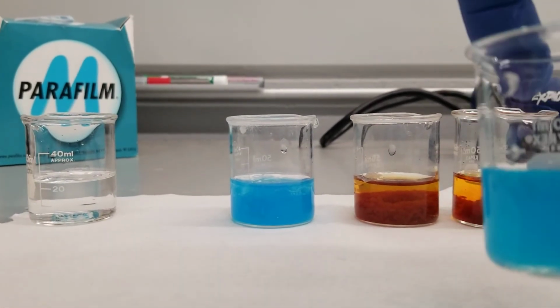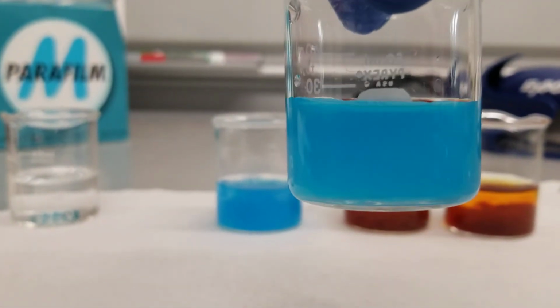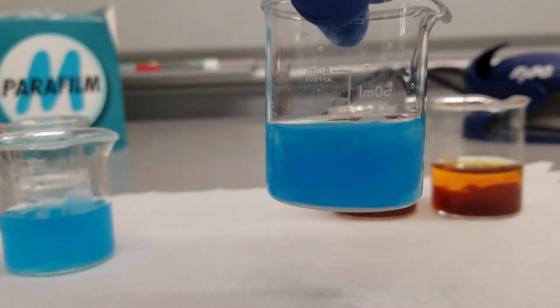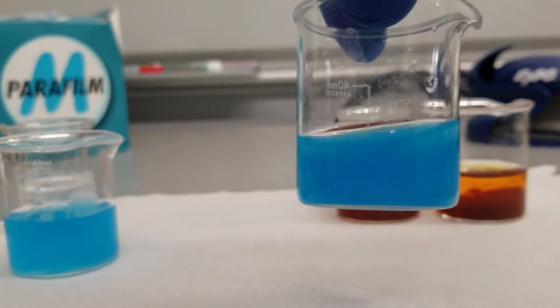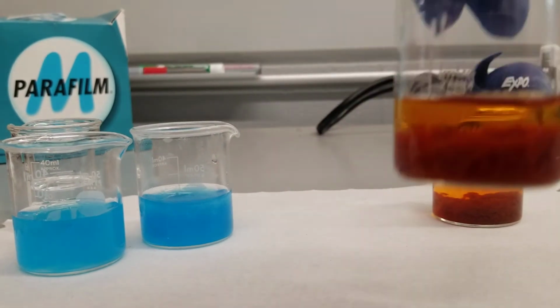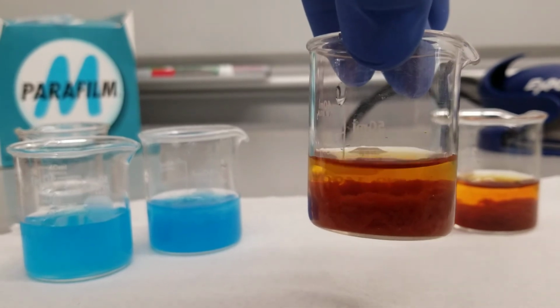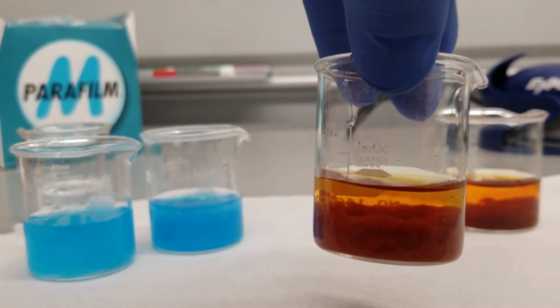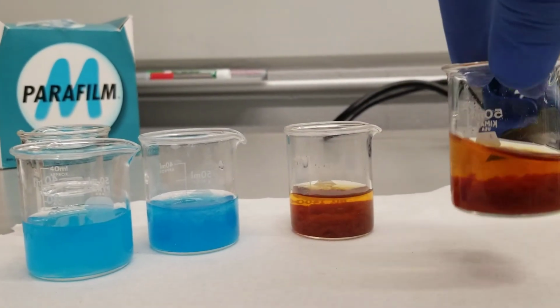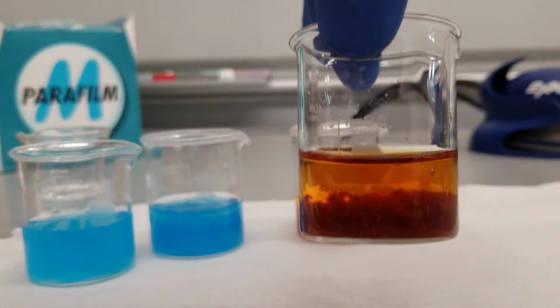I'd like for you to take a closer look at this. If you go over there, so I can see that, you see the color you've formed, and in this one you can see the color and also the amount of precipitates, which is that gooey kind of material you form in the solution. And here you can see much better with iron. It tends to separate a little bit from water, called precipitates, the gooey kind of material. It's a new compound formed when sodium hydroxide reacts with an iron 3 compound. And finally, the last one here clearly has also a lot of gooey material as well.